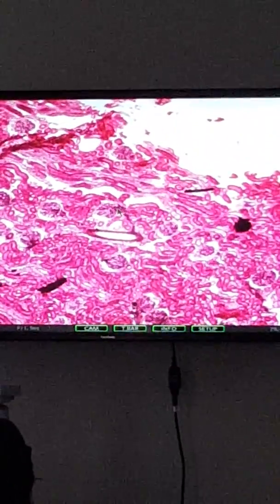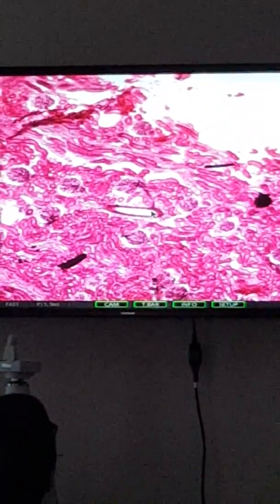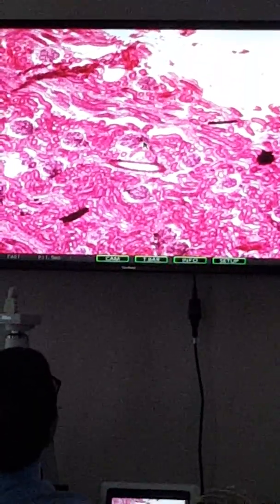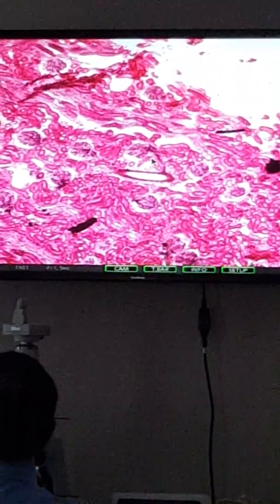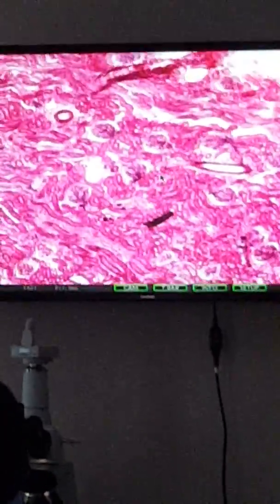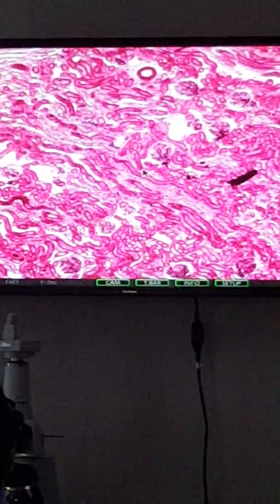But in the meantime, it's giving off a branch. That's interlobular. You can tell because it's giving off a branch, an afferent arteriole, that's feeding this glomerulus. Isn't that sweet? Sometimes you just have to move around.